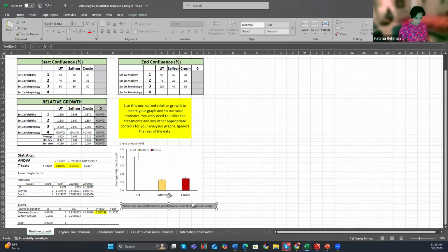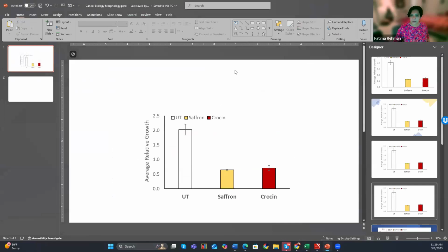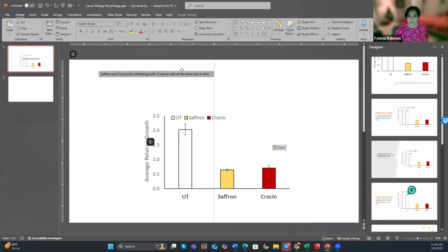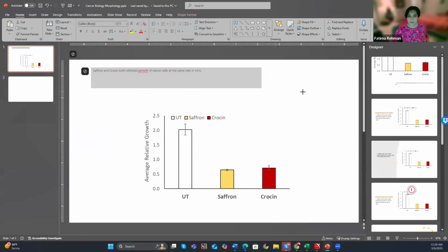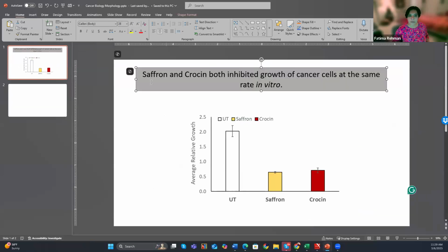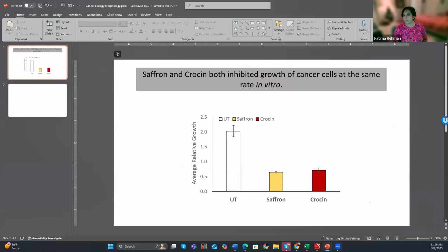Right here, this one, and the color that you want it to be in. You can put that in as a title or as an endpoint at the bottom. In my case, I just wrote it like a title. It's going to be in the right color, so I'm able to see who did what.